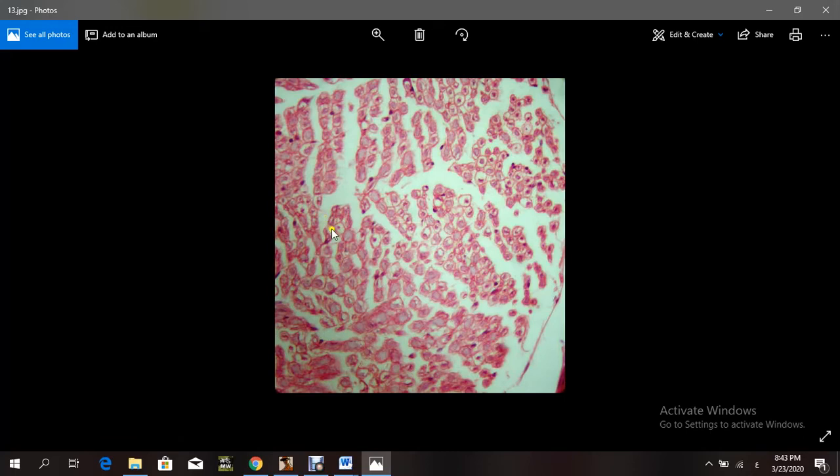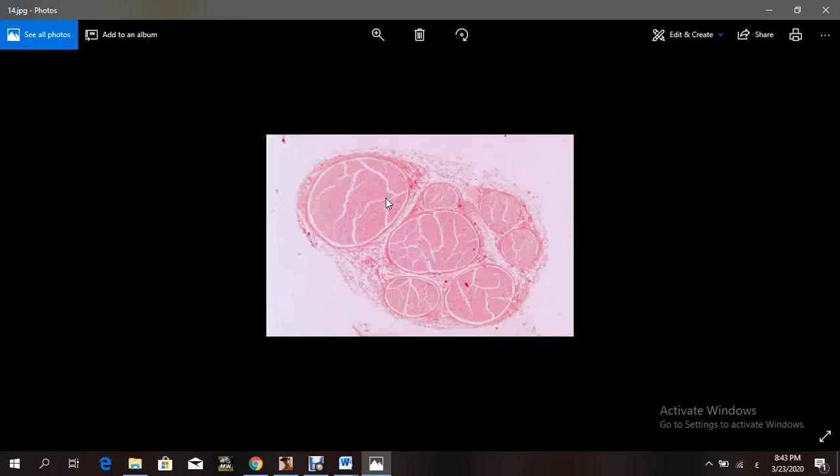At higher magnification, those are the axons. And we said that in H&E, this is the axon surrounded by the myelin sheath, representing the white area. Why? Because the myelin dissolved during the preparation of the sections. This is a cross section within a peripheral nerve.